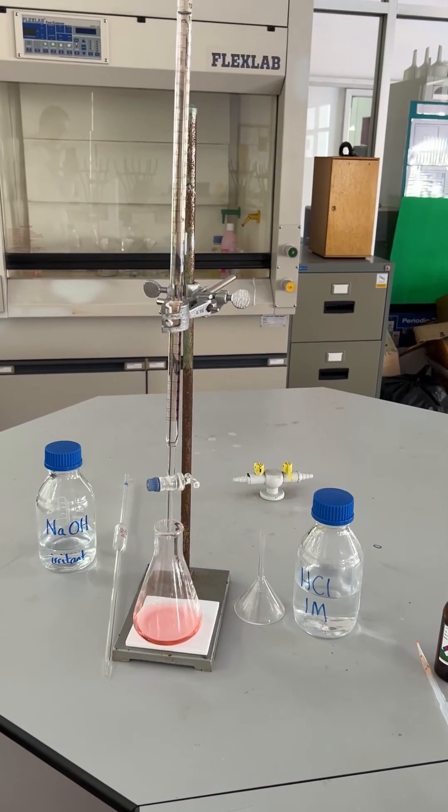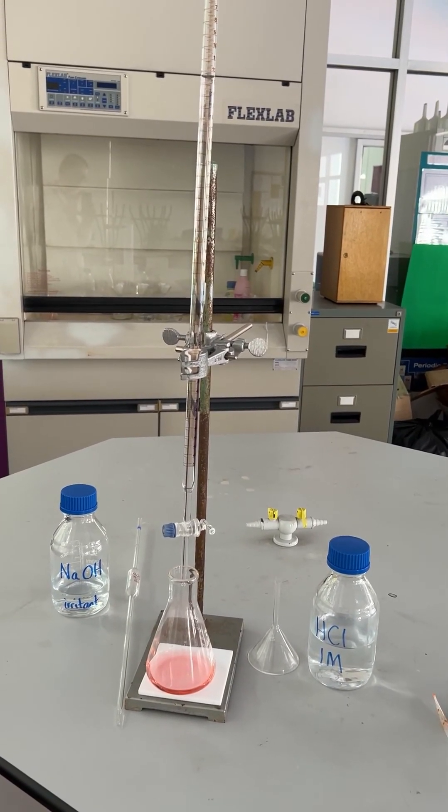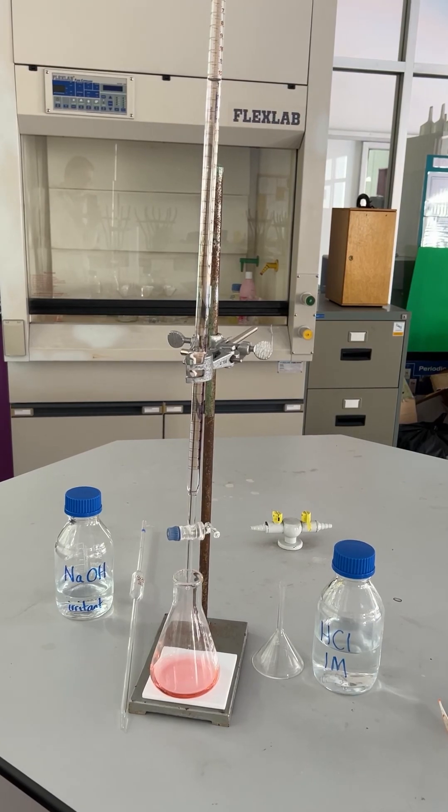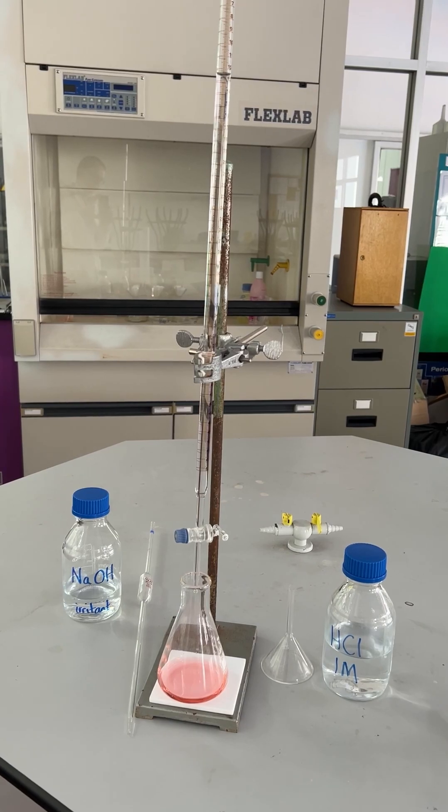So we need to repeat that titration so that we get two readings within 0.1 cubic centimeters. The titration of hydrochloric acid against sodium hydroxide using methyl orange indicator.